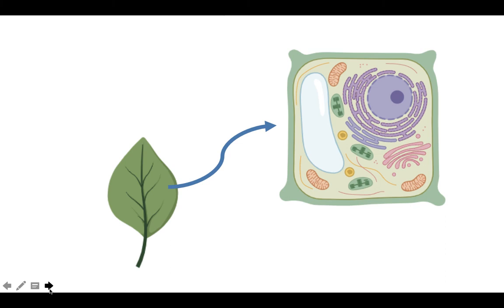So remember that within just a single leaf, you can find millions to billions of plant cells residing on just one planar surface of one leaf. So in each plant cell, you can see here in the blow-up picture, we expect that DNA may come from the organelles, the chloroplast, and even the nucleus.